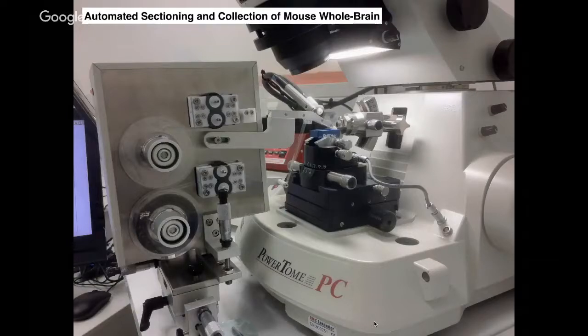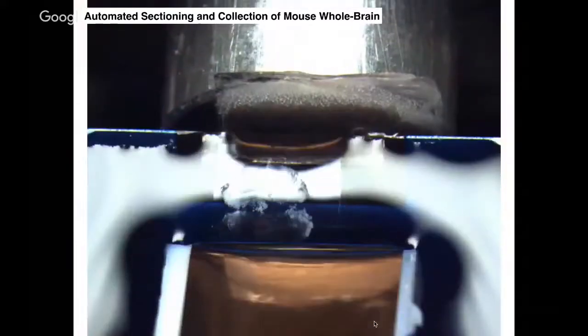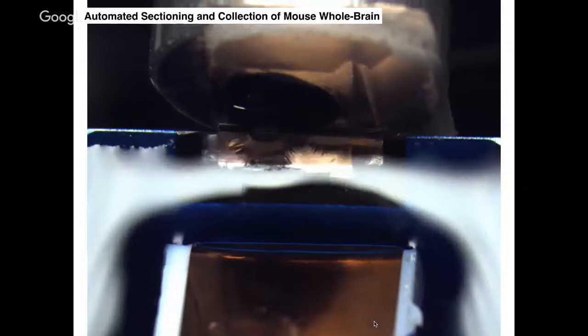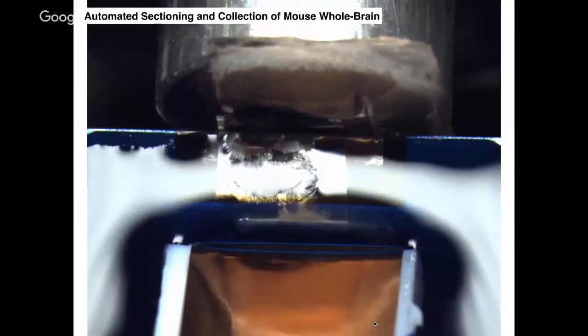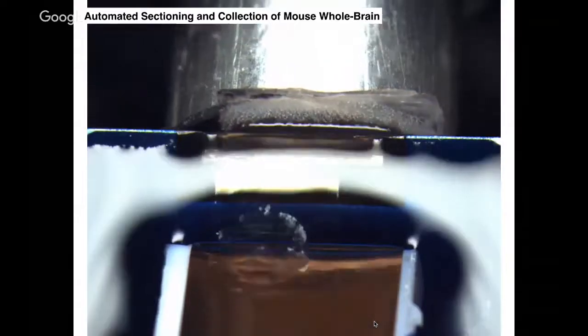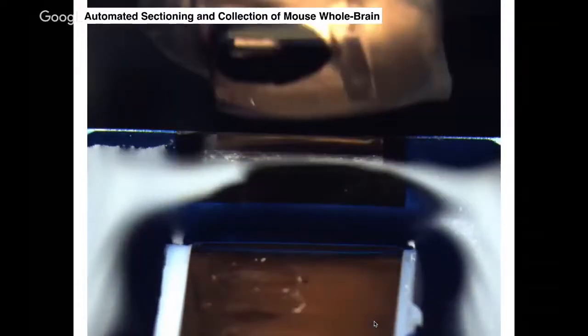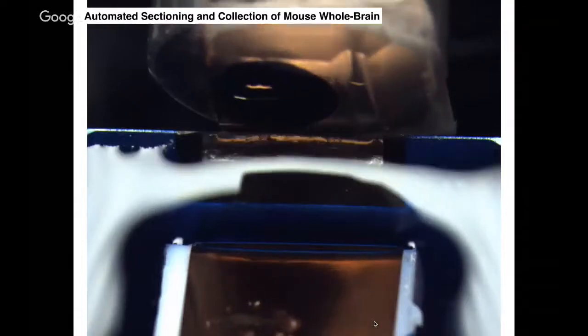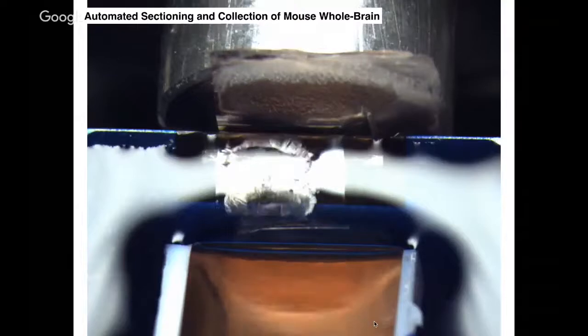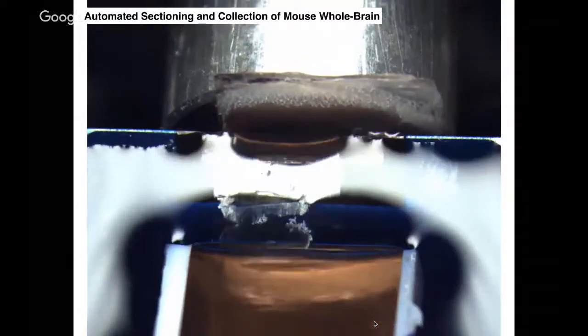What I show here in the sample holder is one of these whole mouse brain samples. And if you just start cutting, this is through the olfactory bulbs of a mouse brain sample. Actually, it looks to be just a slab and not the whole brain in this case. So this is not the full size of the mouse brain. This is about maybe 4 millimeters by 2 millimeters area that it's cutting through. But you should be able to see both olfactory bulbs in these sections that are coming off. The sections are 50 nanometers in this case.